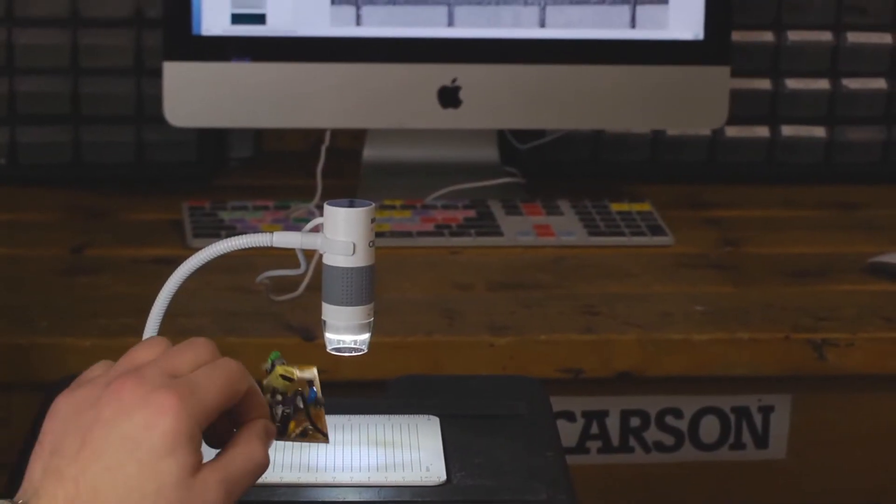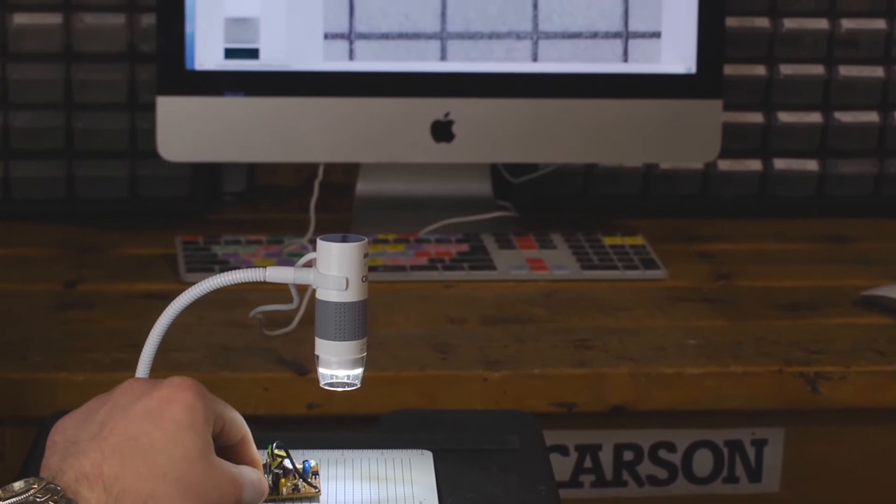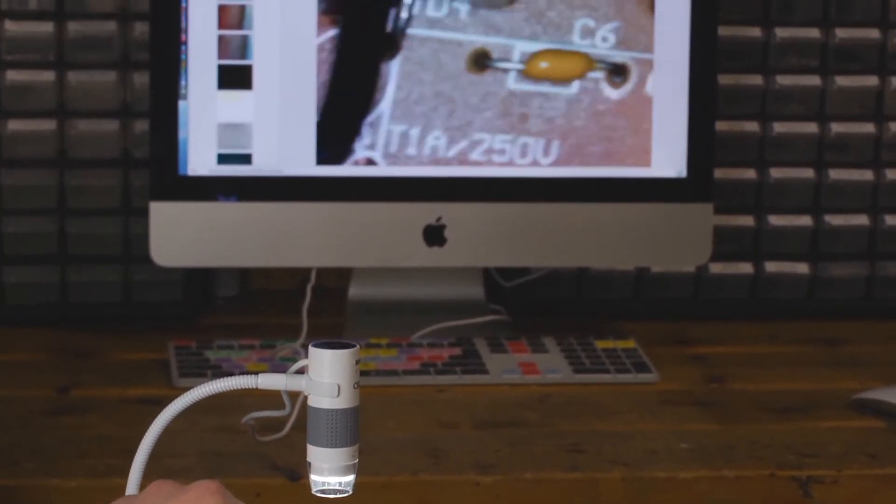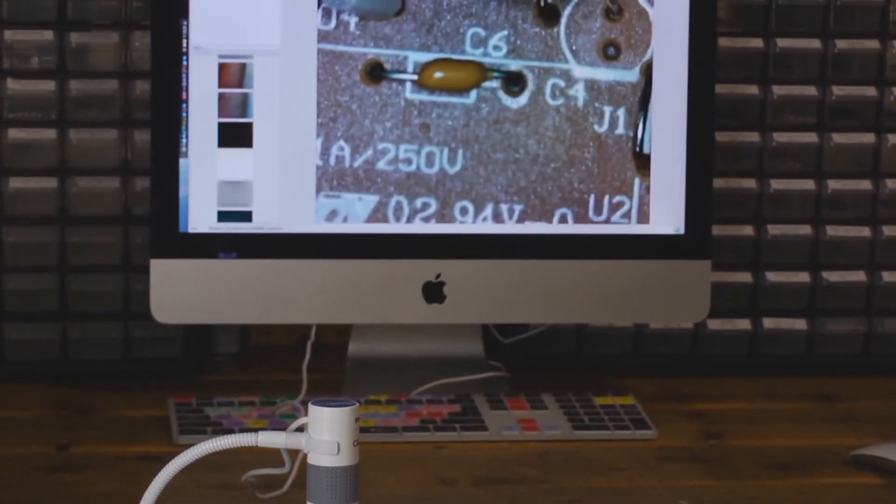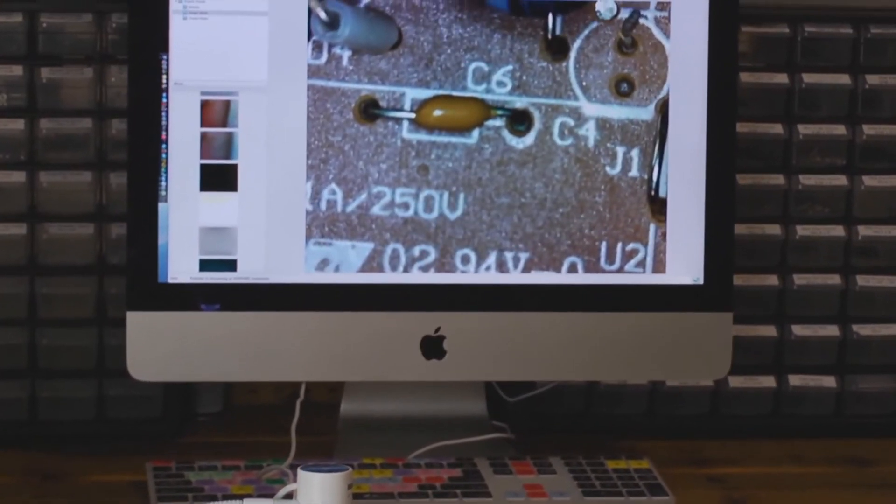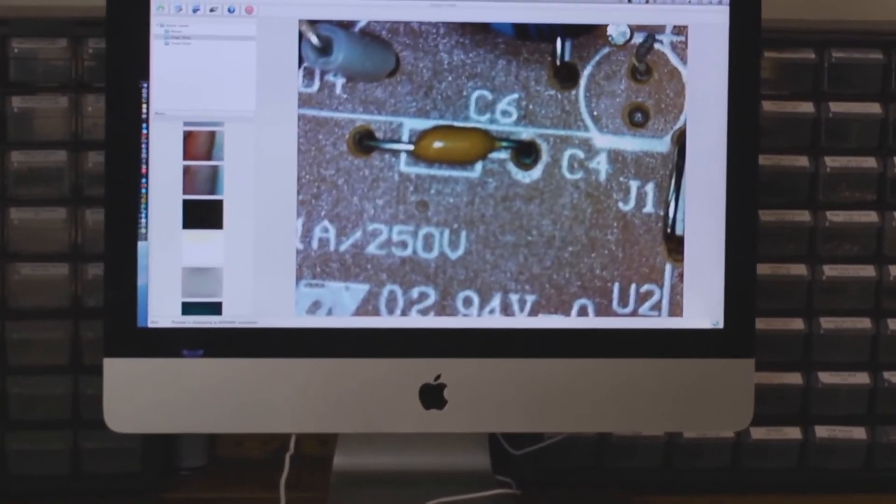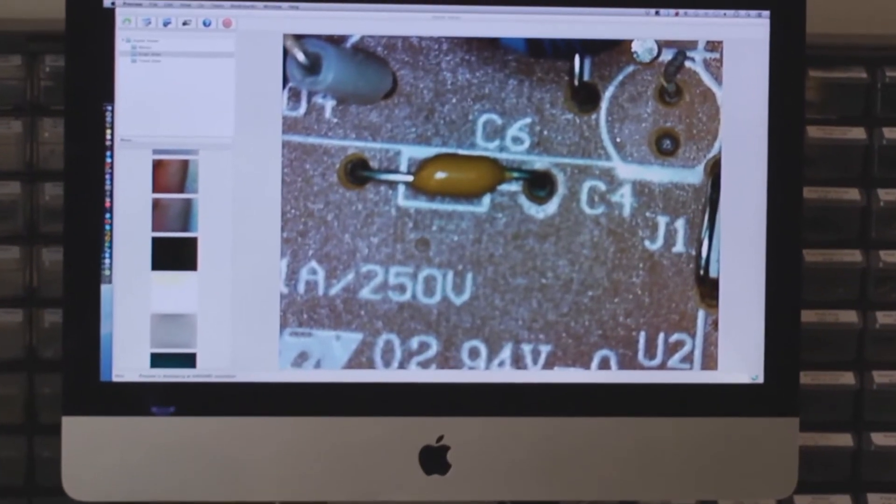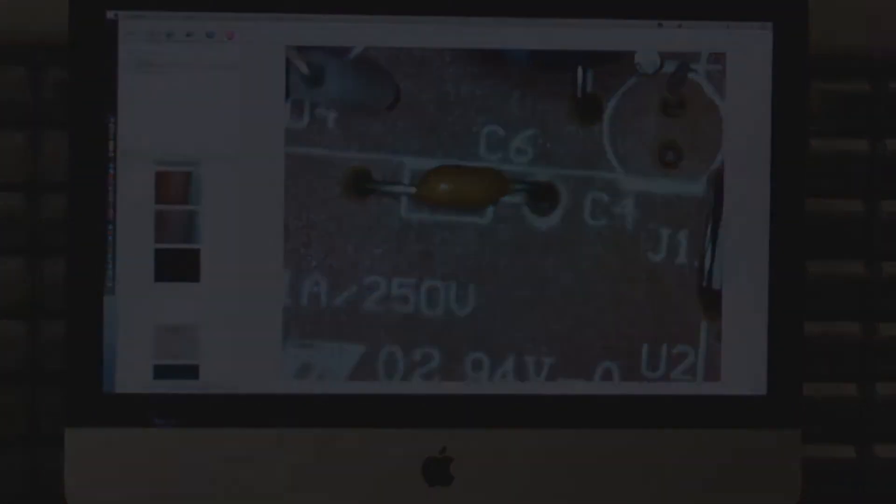There's built-in LED lights that can be adjusted to your preference or even turned off. Having the ability to control your lighting is a huge advantage because that means you can use the eFlex in any lighting condition.